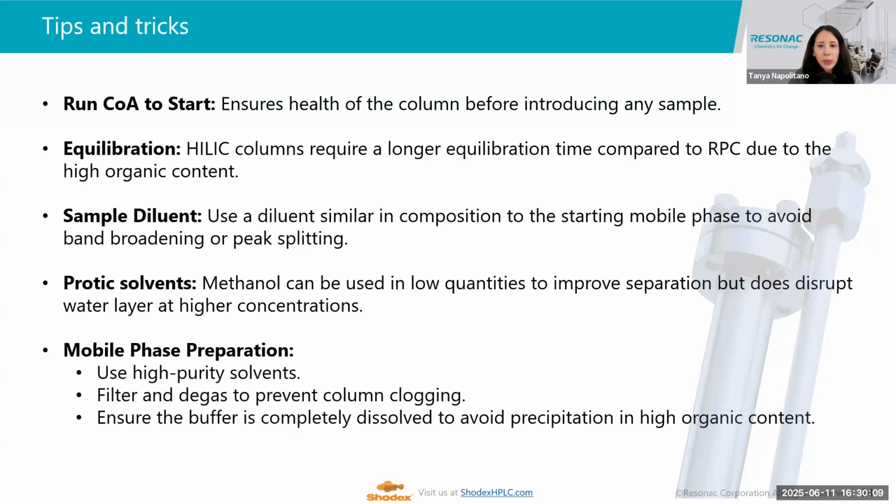And finally, prep your mobile phase carefully. Use high purity solvents, filter and degas everything. Make sure your buffer is fully dissolved, especially in high acetonitrile conditions. And these simple steps can go a long way in improving reproducibility, retention stability, and overall method robustness.